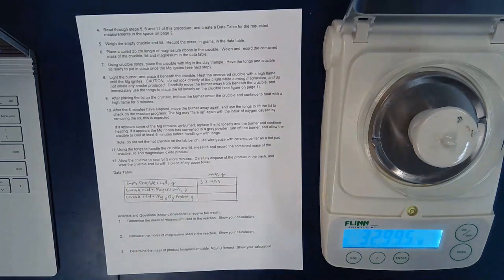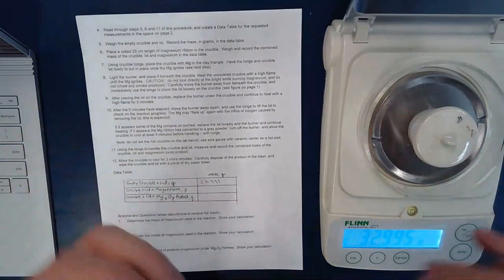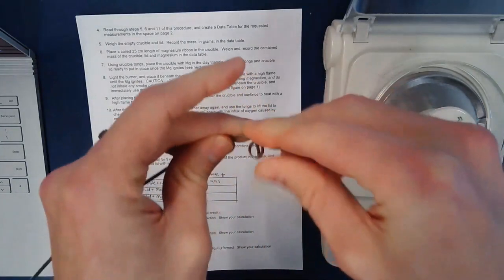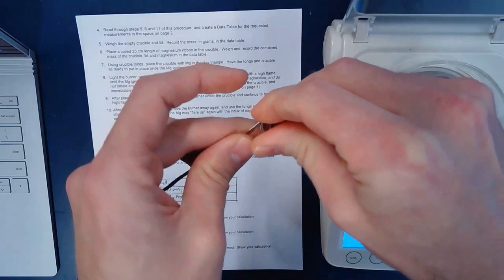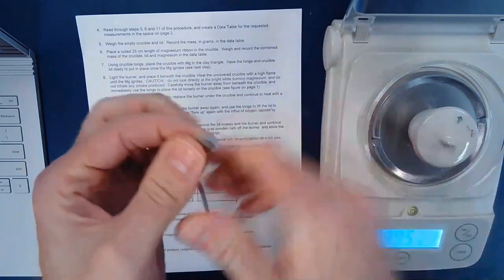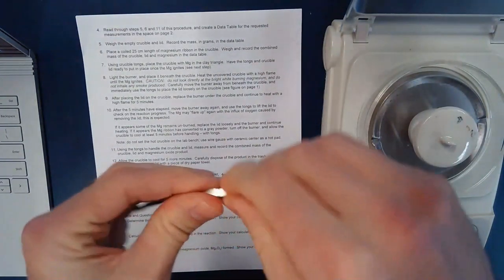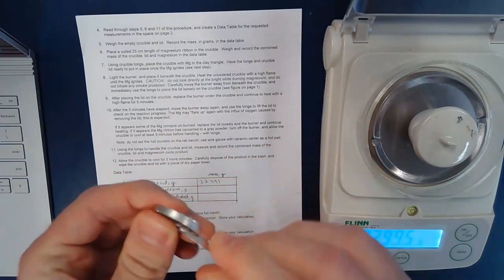Now we're going to add the magnesium into that. We start with about a 25 centimeter strip of magnesium, and I'm going to roll it up so that it can fit into the crucible, and then we'll just add it to the whole mass. So when you roll it up, you try to leave some space between the rolls so that air can get in there.